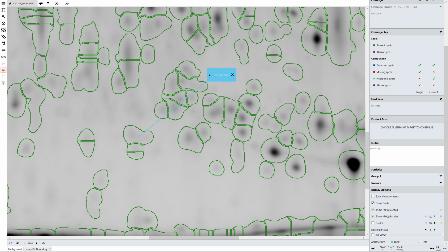Then I can left click on this change text section here and say BL2, for example. Click on OK and you can see that the text has now changed in the annotation. That's as simple as the annotation process is.